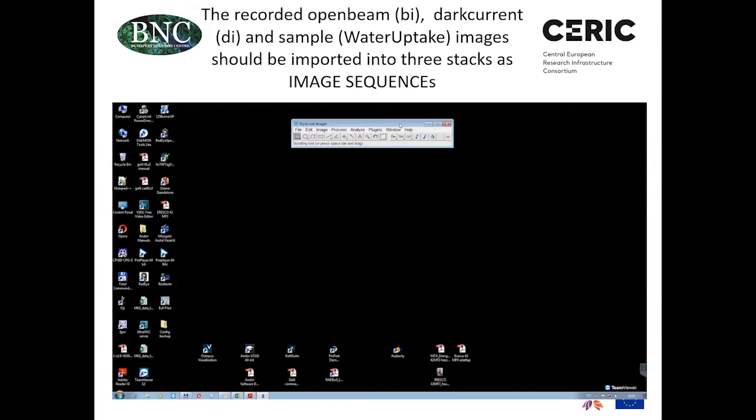And usually in dynamic imaging, we take a series of images, so not only one of them. You can set the acquisition system to take an image every 5 seconds or 10 seconds. And then at the end of the experiment, you can download the entire set of images to your data acquisition computer.